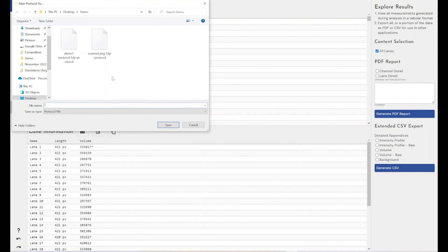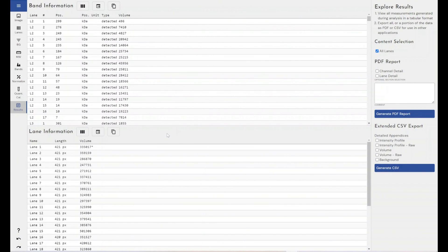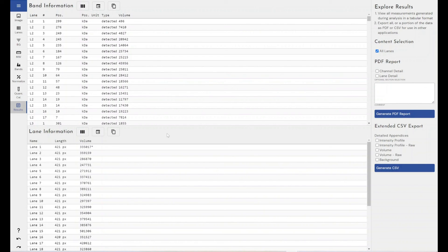So that's the power of the automation features built into Phoretix 1D and the flexibility that we've got within those. And so you've got the flexibility to define all of the settings, not just some of them. And you've got the ability to send these protocol files to other labs, to other sites for them to verify your results or to repeat your analysis the exact way you've already been doing it.